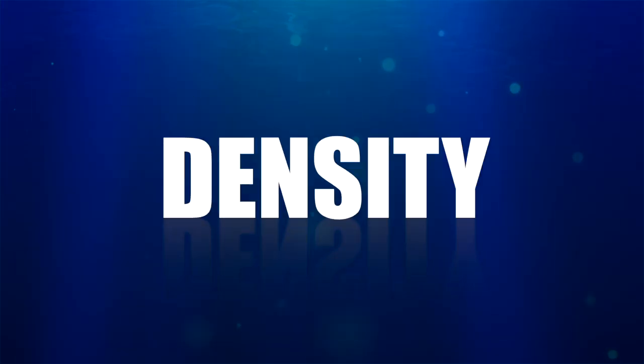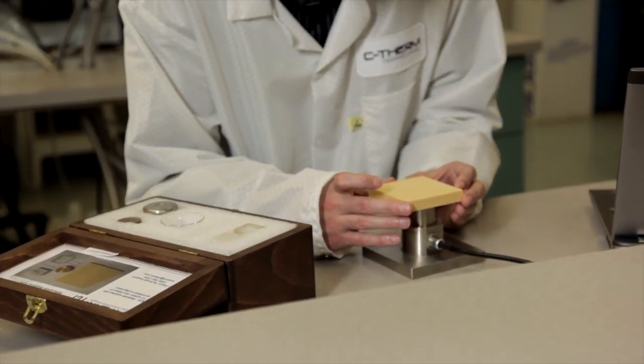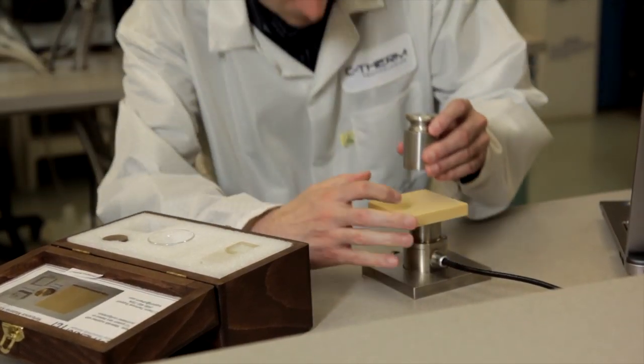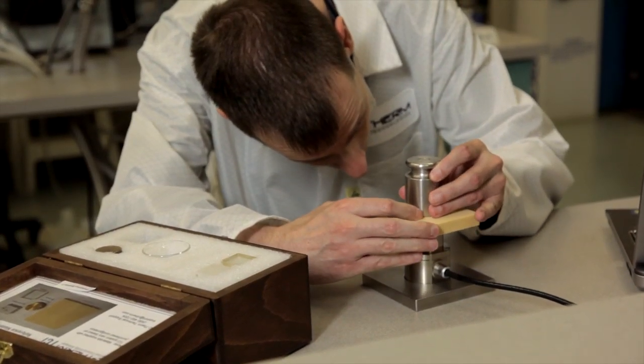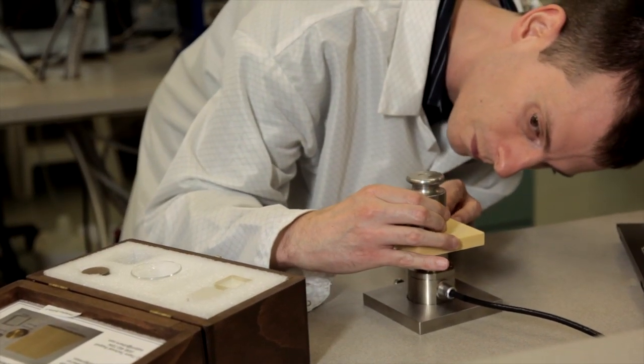The stainless steel sensor is factory calibrated, fully warrantied, and offers robustness and flexibility in a variety of operating environments. Multiple reference materials are provided to verify accuracy and precision.